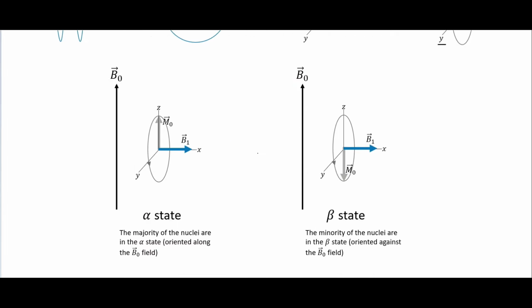And so it's actually a little more complicated than what I'm showing here, because you do things with like 90-degree phase flips, but for our purposes here, we can think about it in this sort of simplified way, where we have the alpha state, which is, remember, pointed along our B sub naught here, but then when we turn on this B sub 1 for a certain amount of time, it will be enough time for us to actually flip the magnetic moment for it into the beta state right here.